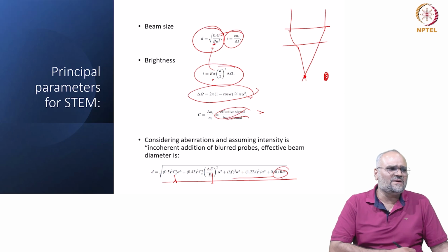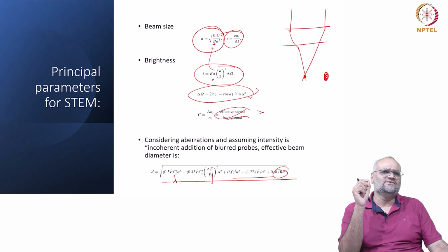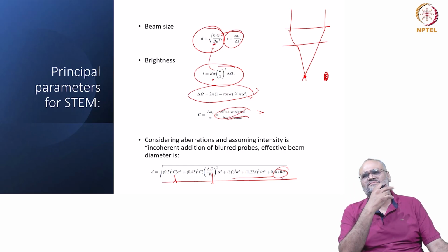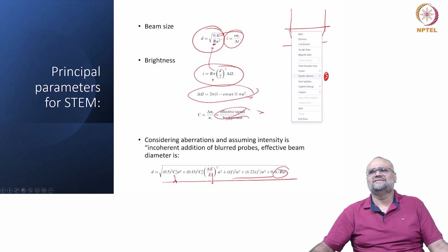So all these parameters together strongly influence my STEM resolution, and based on this I can just show you one of the schematic diagrams from one of the earlier studies or the texts. As, let me erase this here.